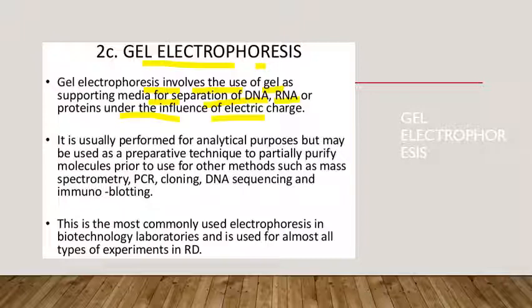It is usually performed for analytical purposes but may be used as a preparative technique to partially purify the molecules prior to use in other methods such as mass spectrometry, cloning, DNA sequencing, as well as immunoblotting. Many other analytical techniques are there.